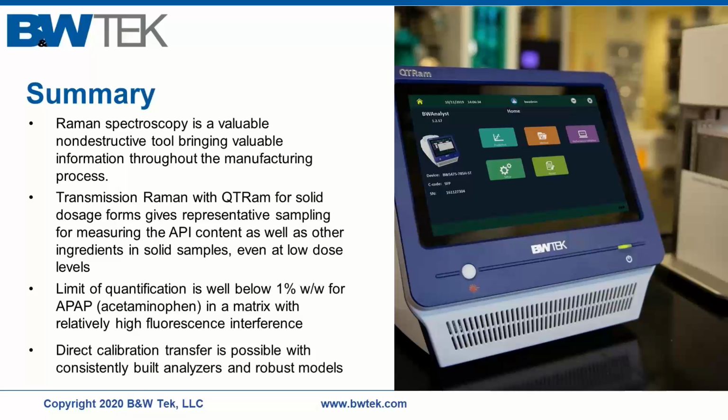Using transmission Raman for solid dosage forms gives representative sampling because you're measuring across the volume of your sample and not just near the surface. And from that, you can measure the active pharmaceutical ingredient content, as well as the concentration of other ingredients in the solid samples, even at low dose levels.